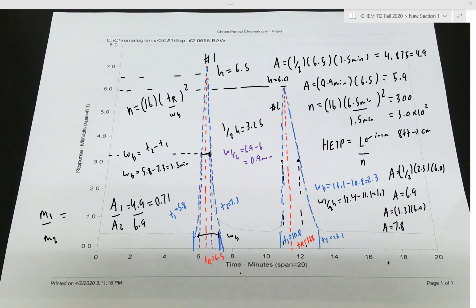Okay, so I've summarized today's laboratory, and don't worry, we'll be doing a refresher next Tuesday as well, going over this lab again, talking about the theory and refreshing the calculations. But I wanted everyone to have this background so they can get a head start in the lab, because it is a 2-week lab and it takes a fair bit of time. I know it seems like I was able to process these spectra pretty quickly, but when you're working on it, it may take you a little bit more time to draw out all the lines and get these calculations sorted.